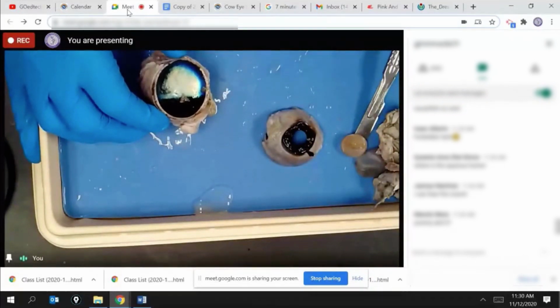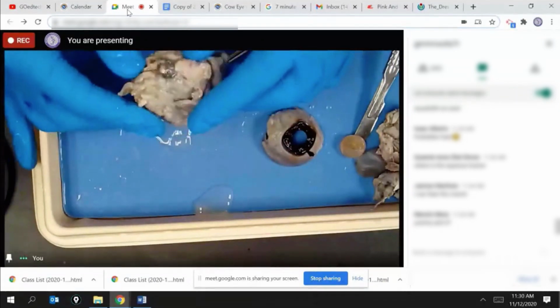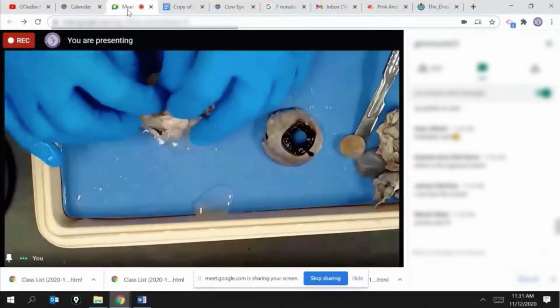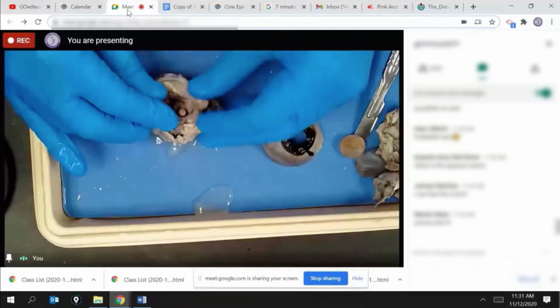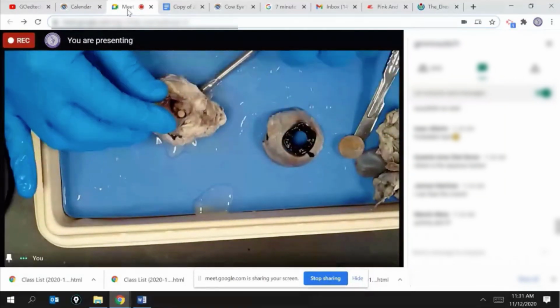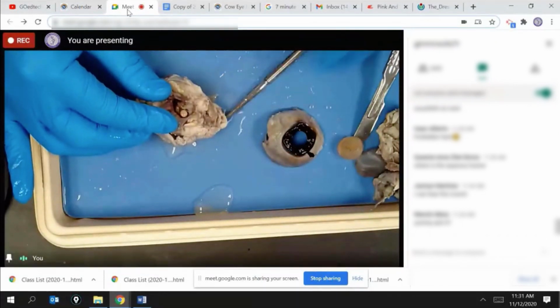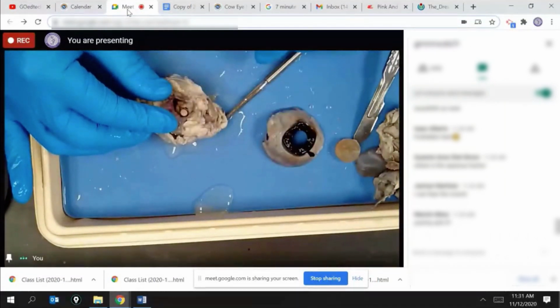So it gathers all this information and sends it down that nerve. Remember the nerve of this optic nerve, this piece of optic nerve, there it is. If I separate this out a tiny bit, you see that piece right there? That's my optic nerve. And that optic nerve will run from this eyeball all the way back to the posterior part of the brain into the occipital lobe.